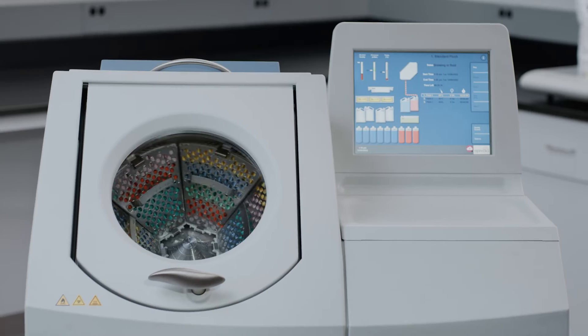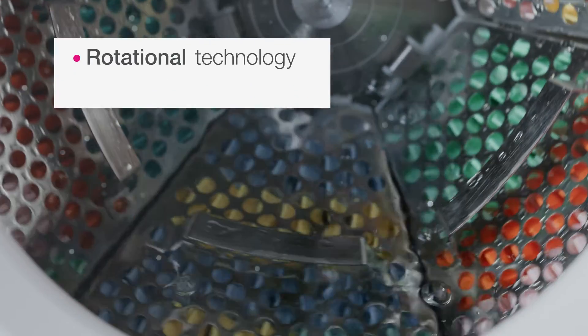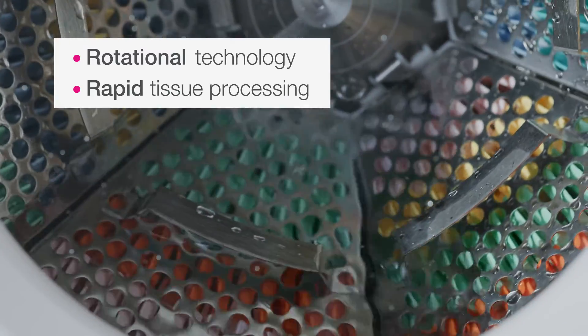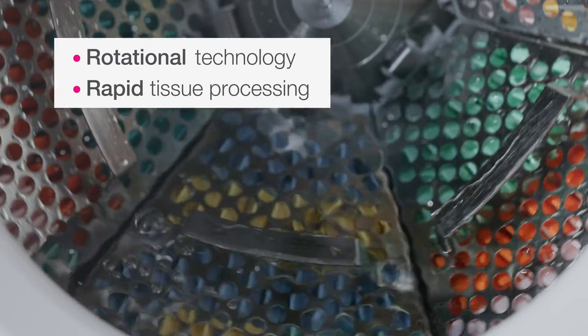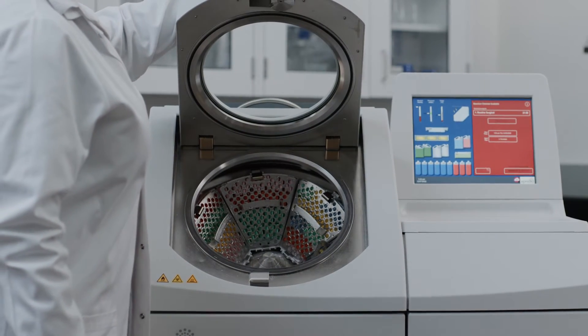The Revos Tissue Processor features a state-of-the-art canted chamber that rotates back and forth to enhance reagent distribution. This unique method helps decrease the time it takes to process tissue samples and does not require heat.